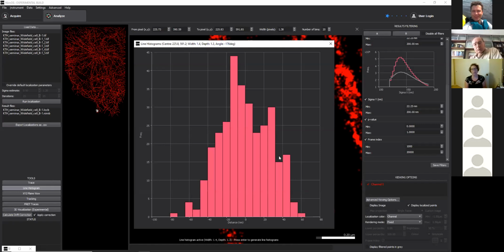And also, whenever you're doing DStorm imaging, you have to consider the fact that, especially if you're using antibody labeling, your target is going to be a certain distance away from the fluorophore that you're using to image it, and that distance is going to be the length of the antibody. So you're actually going to add distance between your target and the fluorophore.